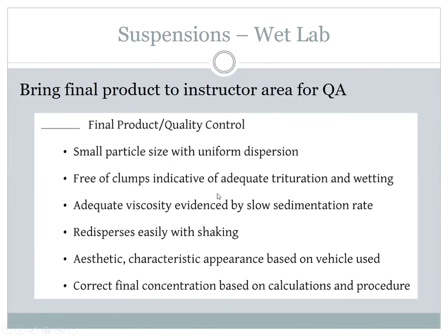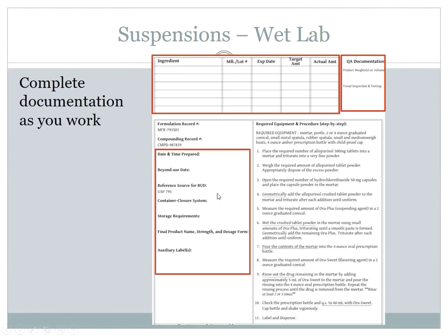Now we're going to bring it over. We're going to QA it. We're going to check for floaters. We're going to check for a correct final volume. I will tell you this, check your volume, because even if you measure exactly the right amounts for the ingredients, because some of it stays in the mortar through the rinsing process and everything, you might end up a little bit lower, okay?